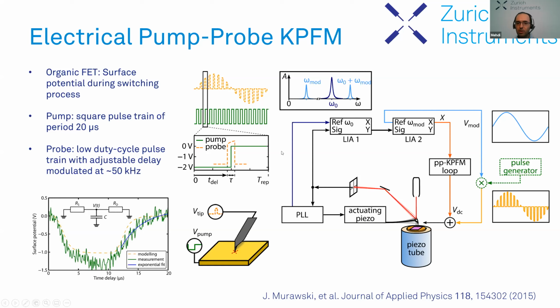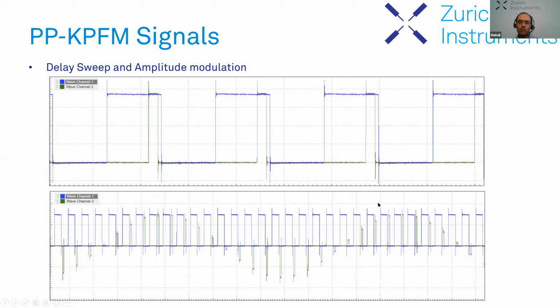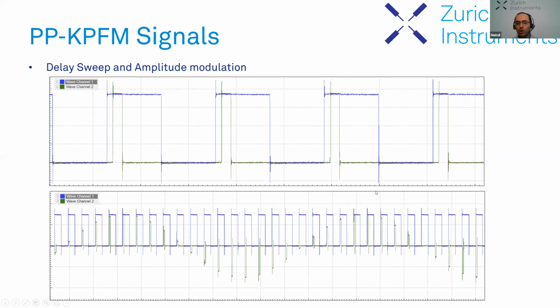So that's a typical KPFM with electrical pump probe approach. So let's look at the type of the signal that we would like to generate.